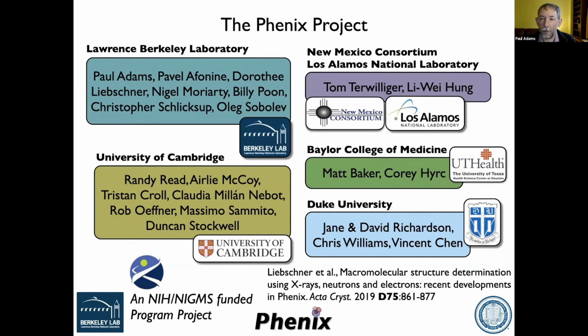Which is a good approximation at the moment, but there are shortcomings, which include that we don't really take into account charged atoms and ions. So those are going to be artificially different in the simulated map versus your experimental map. And really, you're asking about something really cutting edge that we are working on right now, and mostly Dorothy is working on it together with people from UCLA.